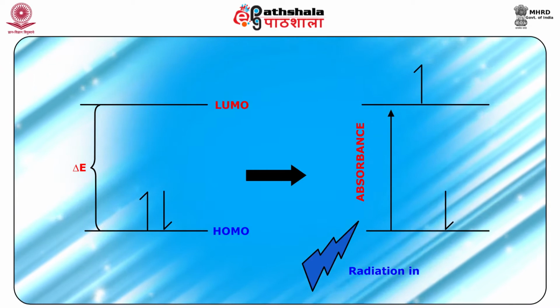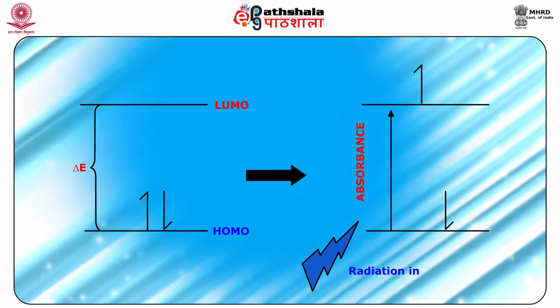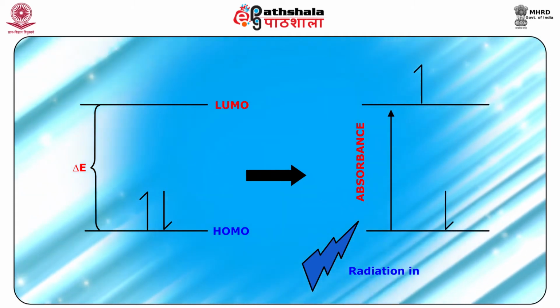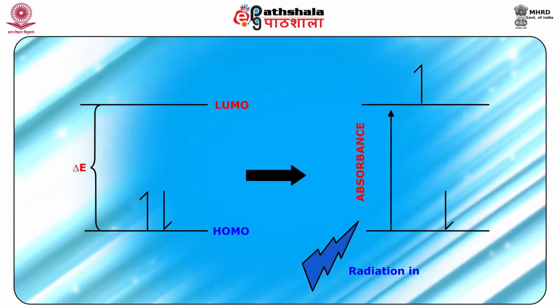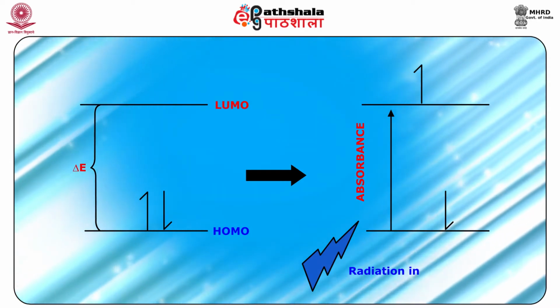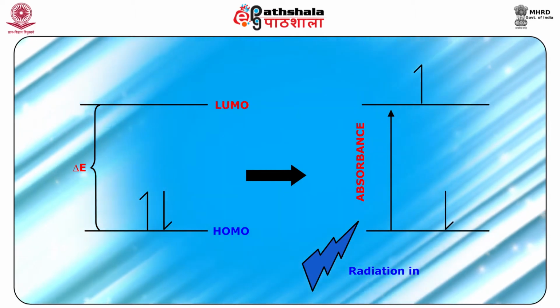The absorption of electromagnetic radiation in this region results in a transition between electronic energy levels in which electrons from the ground state of the molecule are excited to higher electronic state in molecule. The most probable transition is from the highest occupied molecular orbital, HOMO, to lowest unoccupied molecular orbital, LUMO, in a molecule as shown in figure 2.